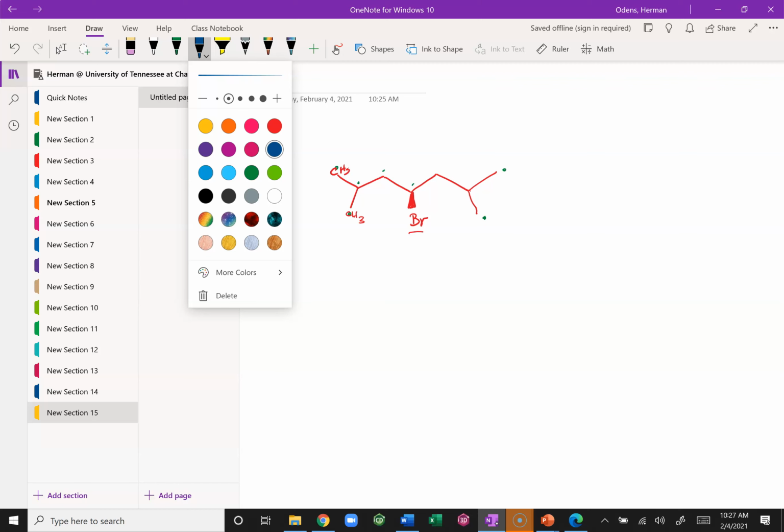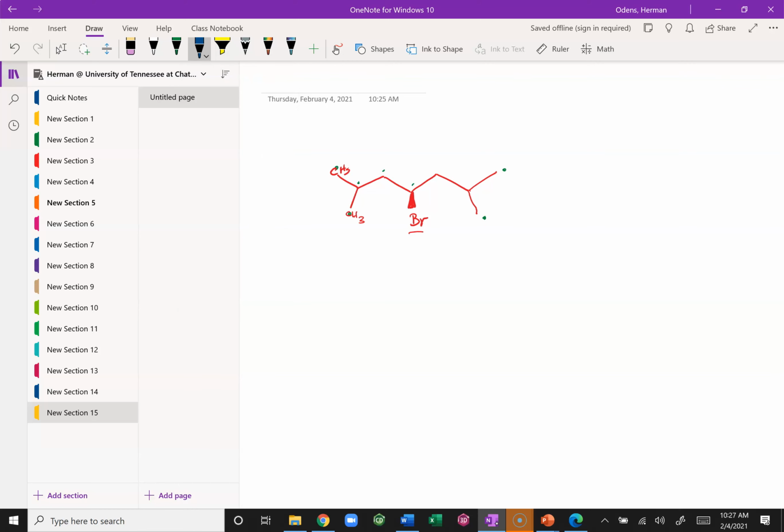Don't let yourself get tripped up in one of the unknowns that you'll have for the lab. So you will have to count that like this: 1, 2, 3, 4, and then 5. You have 5 types of carbons here. And that's because those 2 methyl groups have different environments.